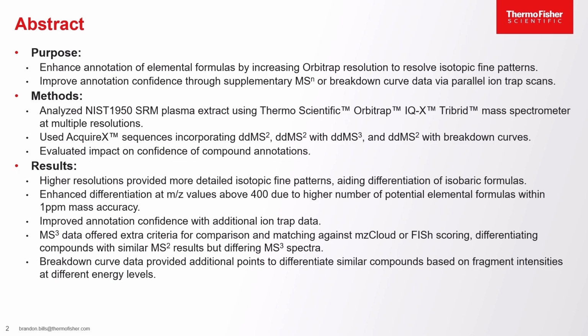And we also showed that MS3 data could provide extra criteria for comparing against mzCloud or using fish scoring, which helps you differentiate compounds with very similar MS2 results, but that had differentiation at the MS3 level. We also looked at how breakdown curve data can give you some additional data compared to what a stepped collision energy can give you.